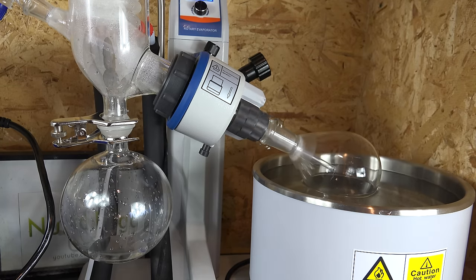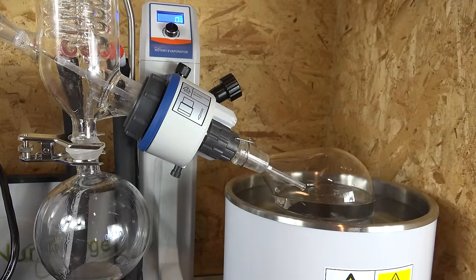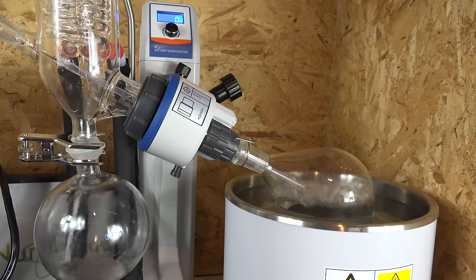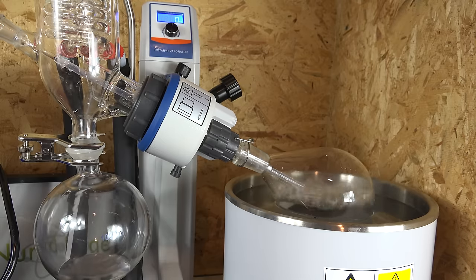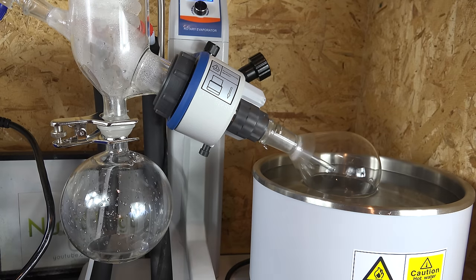So why do we want to rotate the flask? There are a couple of reasons. First, the tumbling action stirs the product so it evaporates faster, and does this without a stir bar — stir bars can be inconvenient especially when you want to weigh your product. Second, the tumbling action reduces a problem called bumping, where the mixture flash boils so violently that it shoots up into the condenser and splatters everywhere, contaminating the rotovap and losing valuable product. Third, rotation causes the product mixture to coat the inside of the flask by surface tension, effectively increasing the evaporating surface area, allowing even faster evaporation — you can't really do that just by stirring, and this gives the rotary evaporator a tremendous speed advantage.